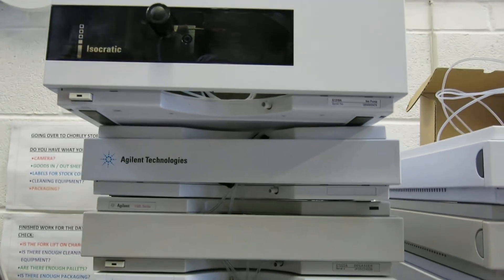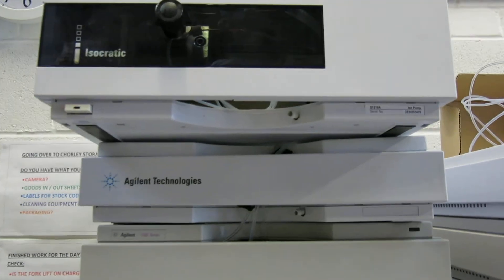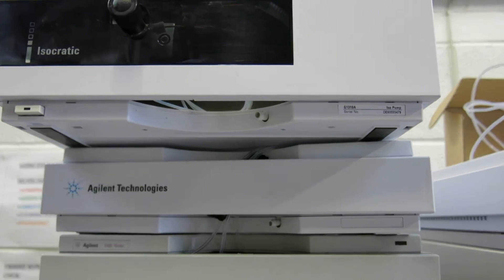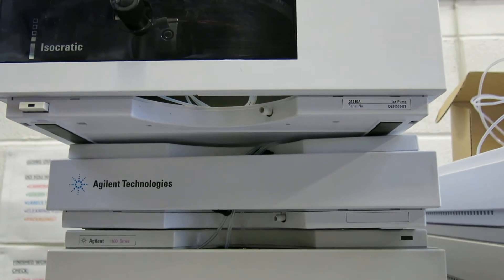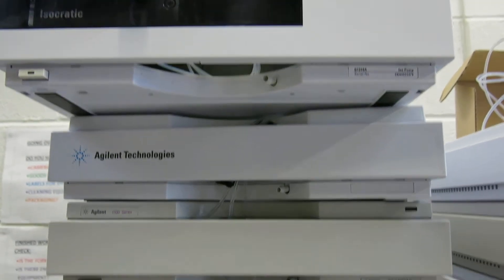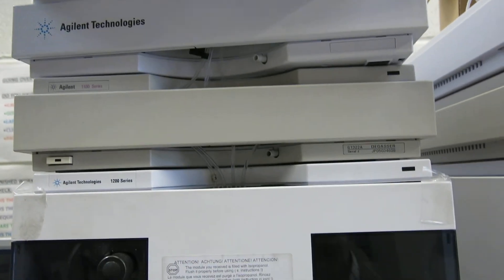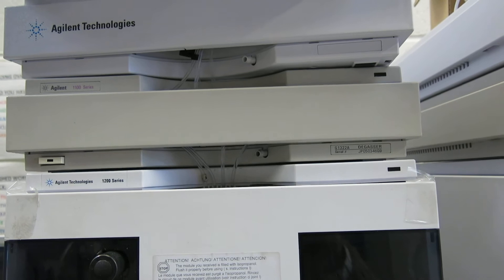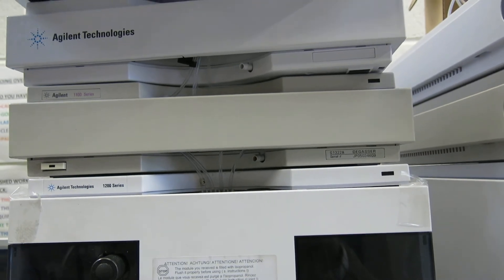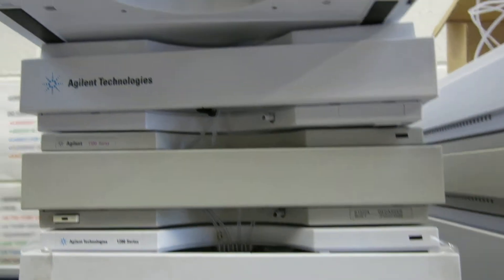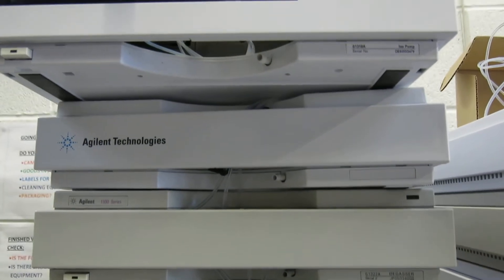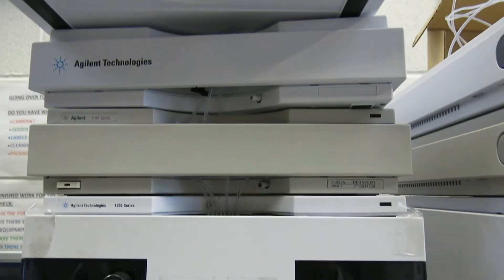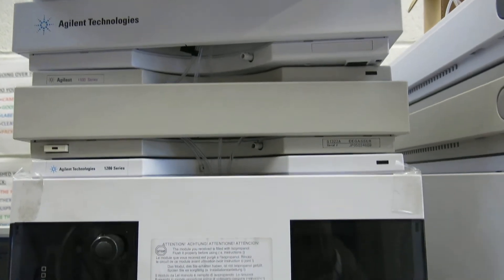We just go down through it there. The isocratic is a G1310A. We've then got the degasser which is a G1322A. We've got a bottle container just midway between those two.